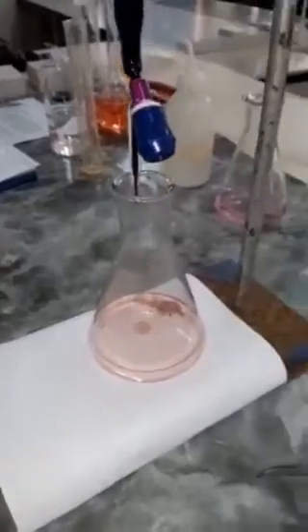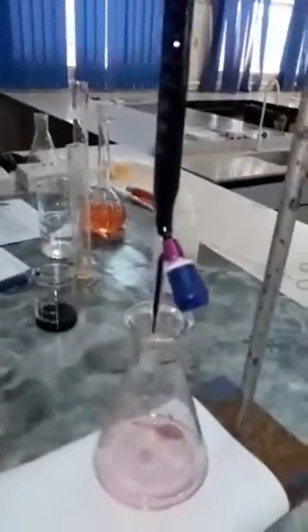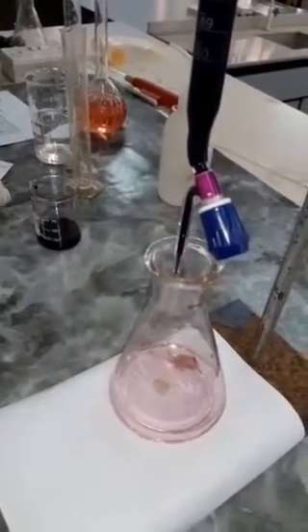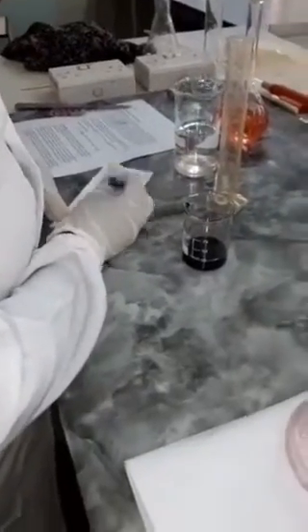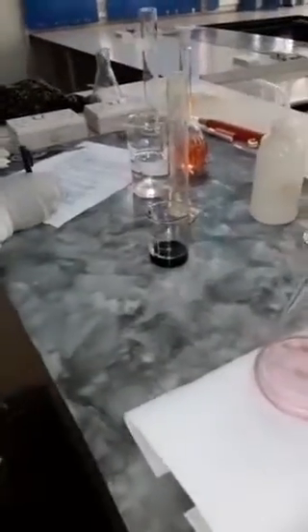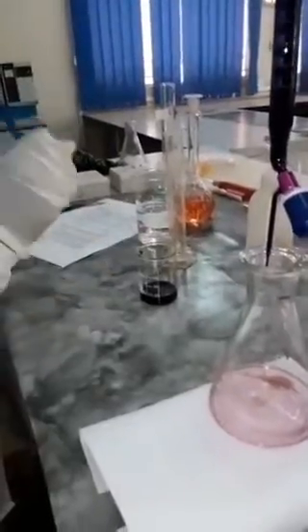So for the third one, for the third trial, we're starting at our previous reading, which is 11.6. So I'm going to titrate the third one until there's a color change. So our color has changed for the last one, and the reading is 17.4. So we'll record 17.4 and subtract 11.6, which gives us 5.8. So we have our three readings, which will be shared to you, which is 5.7, 5.9, and 5.8. Those are the three titer values for this titration.